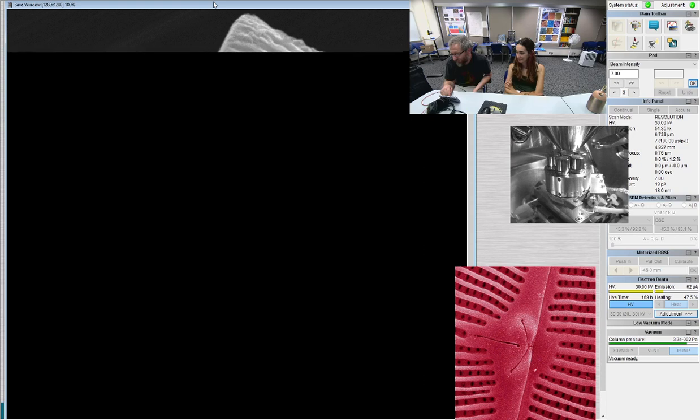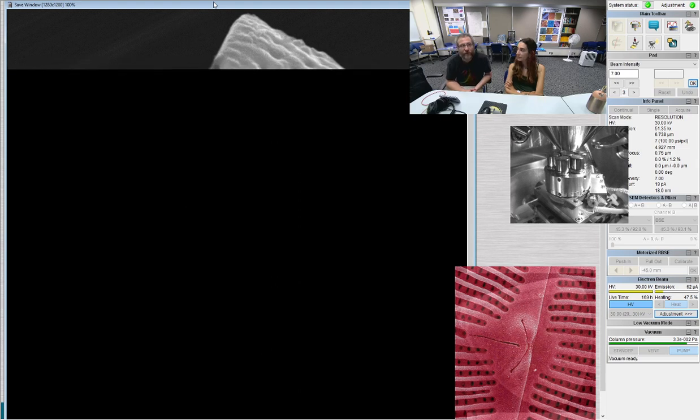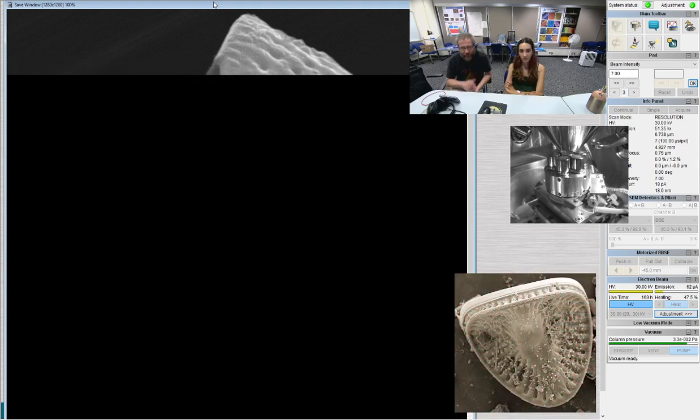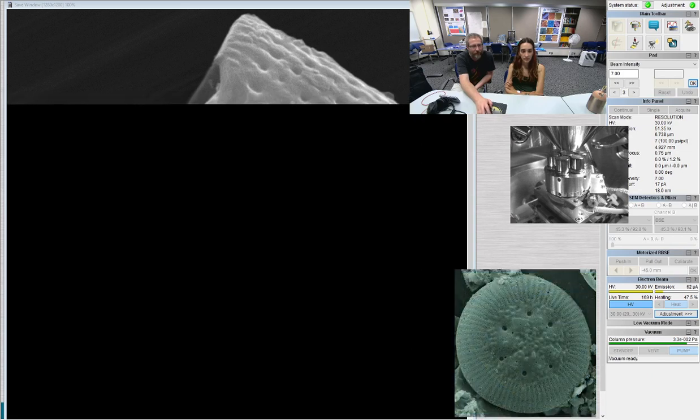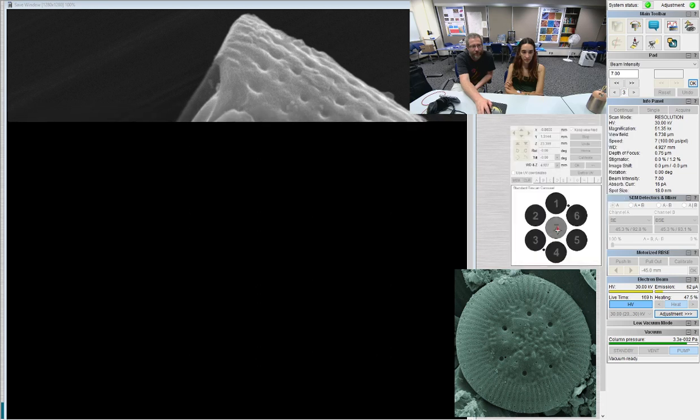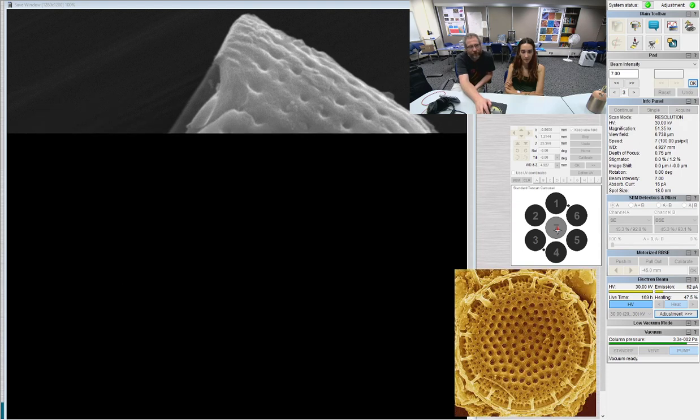If these are on a slide, do you mark X and Y axis, or is it easy to find them? So, can they see that? Let's see. I don't think you can see it. There's another panel. Let's see. Chamber view. Stage control. So, you should be able to see it now.